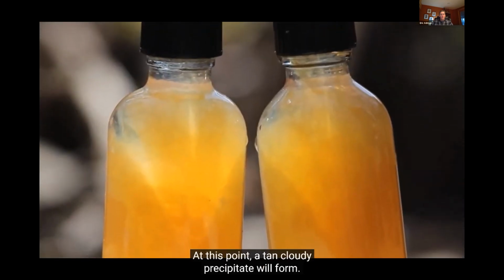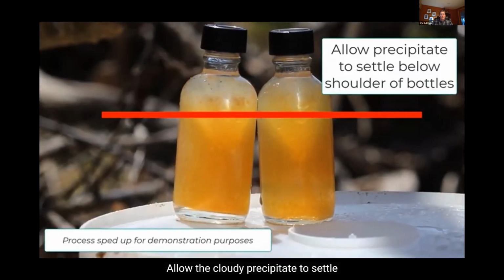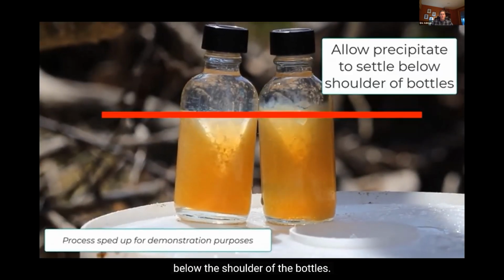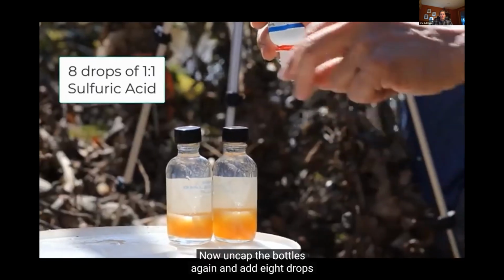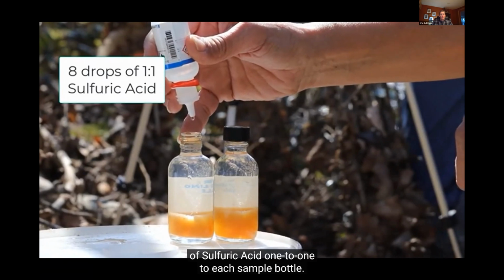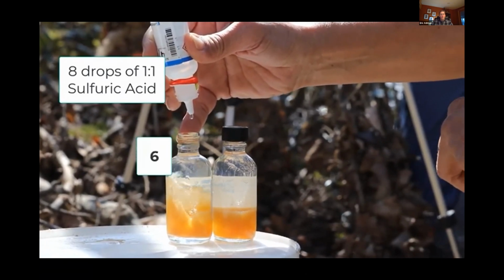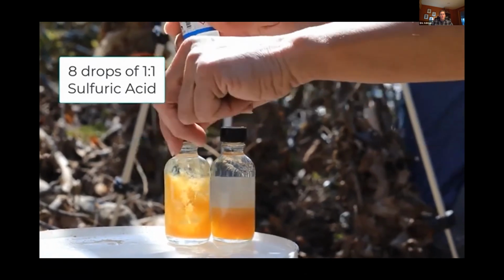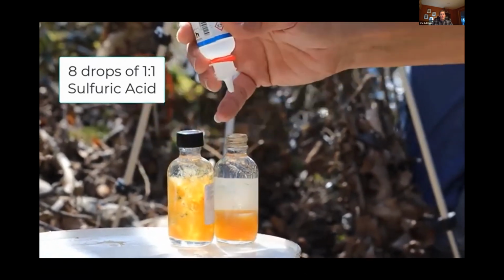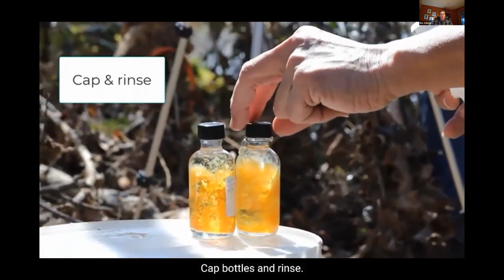At this point, a tan, cloudy precipitate will form. Allow the cloudy precipitate to settle below the shoulder of the bottles. Now, uncap the bottles again and add 8 drops of sulfuric acid, 1:1 to each sample bottle. Cap bottles and rinse.